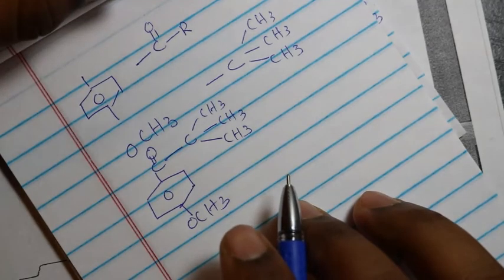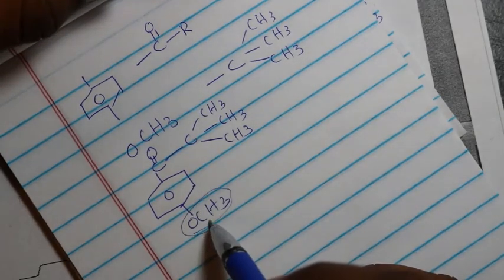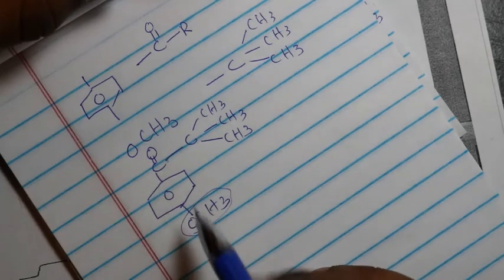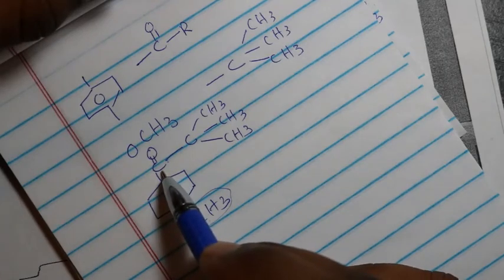This is the only possible structure, because we cannot connect the methoxy group to the carbonyl, because we already confirmed we do not have any ester. So we have a ketone and a methoxy group.